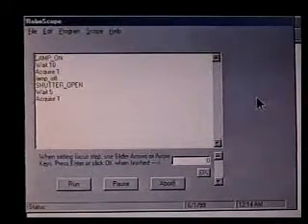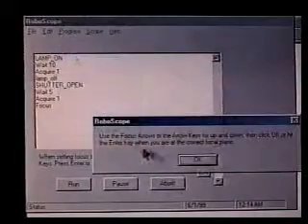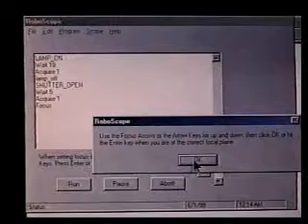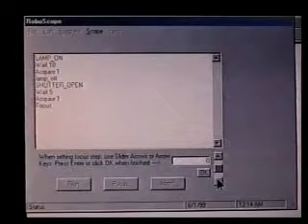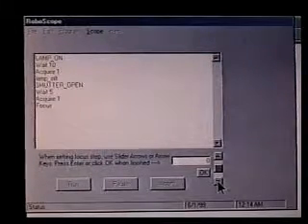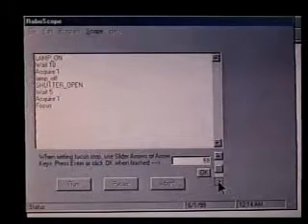And now we're going to focus to a different focal plane. So, when you activate the focus command, a little dialog comes up which tells you that you can either use the arrow keys or the arrow buttons on the keyboard in order to change the focal plane. I'll use these arrow buttons on the program here. So, as this is counting, the stepper motor on the focus knob is focusing, and we're moving to a different focal plane.